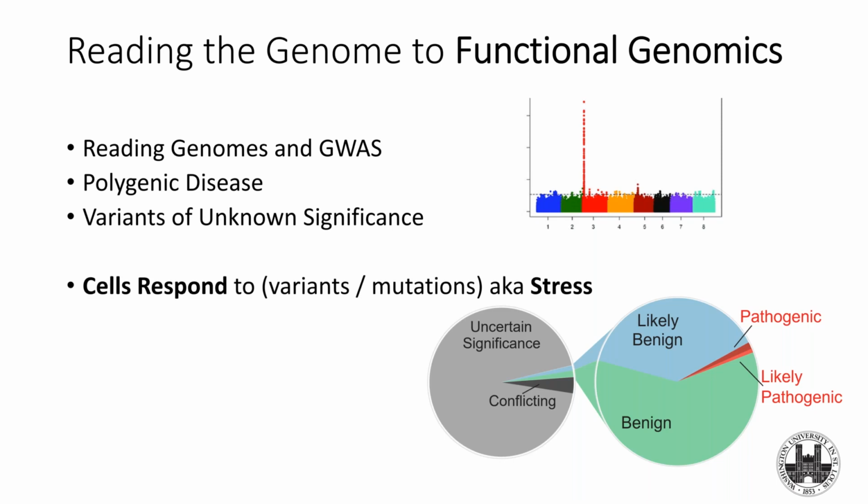I'm specifically interested in how cells respond to stress. And when we thought about a way to scale this up and do functional genomics at larger scale, we knew we were going to have to look for complex and subtle phenotypes. We didn't want to look at later stages when cells are just dying or, in cancer, when growth rate is affected. We wanted to look at earlier stages when things are going on that are really interesting, like changes in synapse, changes in neurite outgrowth, changes in degeneration. But all these things are very hard to look at. And we knew that to scale this up, we'd have to do it at the level of a cell, so it had to be cell-based.